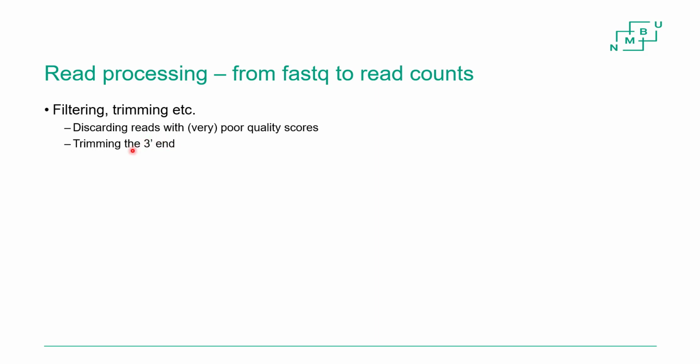And as you saw in the previous slide, we want to merge the reads, where they overlap, right? So we want to join them together into one single read. And that is actually a little bit easier if you trim off the worst part of the reads. But you mustn't trim so much that you lose the overlap. The length of the overlap must be long enough, you could say.